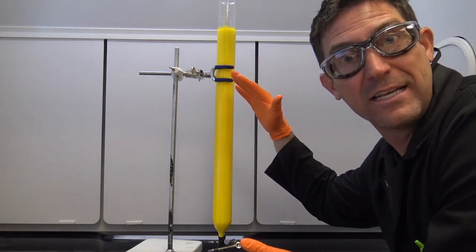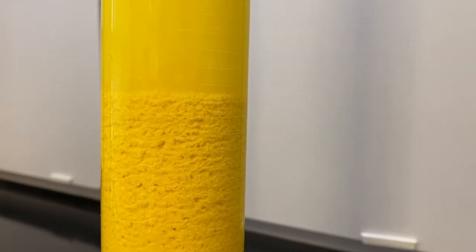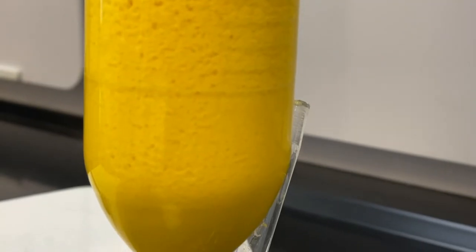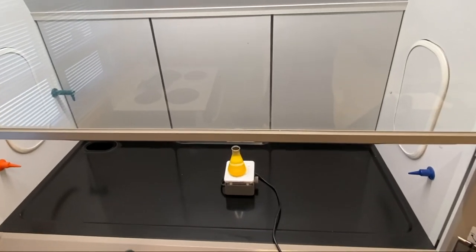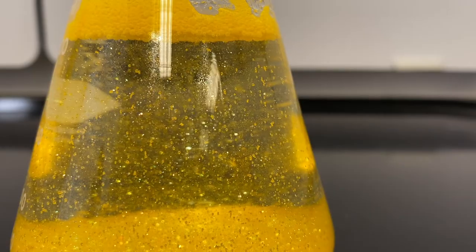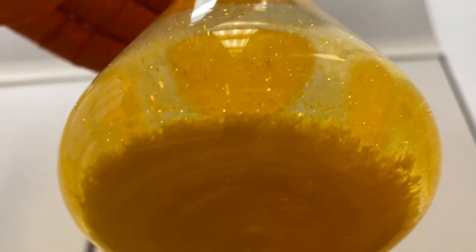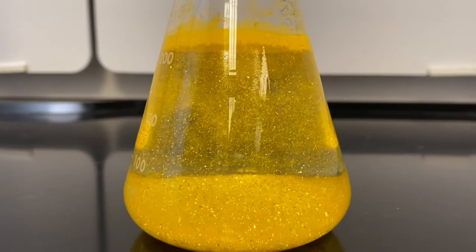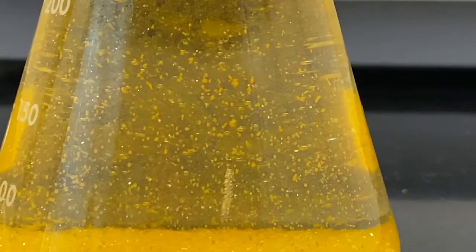There we go — that's the precipitate. Look at it. You can see it falling out of the solution because it's not soluble. We mix those two clear things together and boom — we get this yellow precipitate. Isn't it wonderful? Let's go back to the flask we heated earlier. I let that settle and cool, and look what started to happen: that lead iodide as it cooled down crystallized and made these beautiful lead iodide crystals.